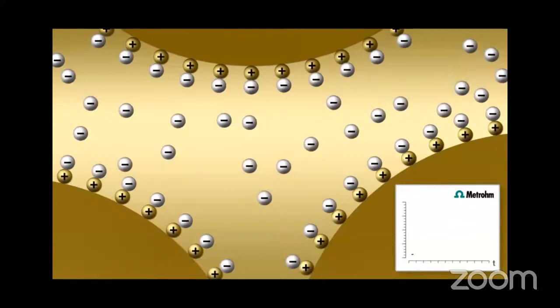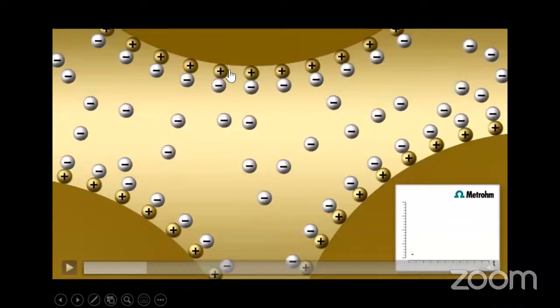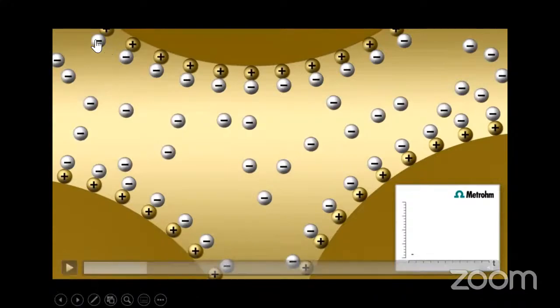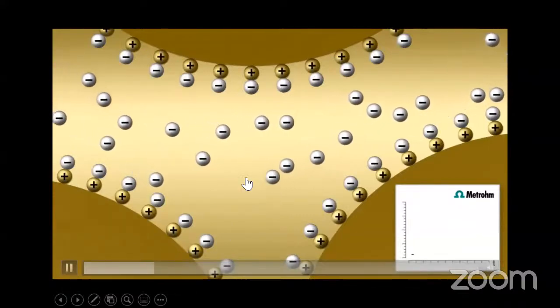Sodium is not going to be attracted towards the basic column material, because the sodium is positive and the anion exchanger is also positive. So it doesn't have any meaning, so it is repelled. But those white ions, which are already attached to these positive sites, are your carbonate ions. So it keeps moving.